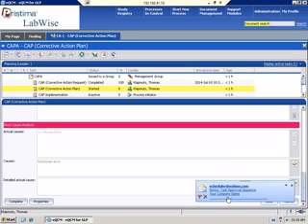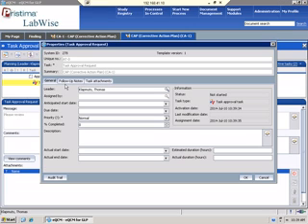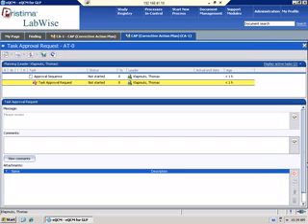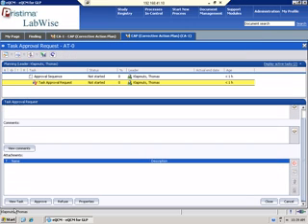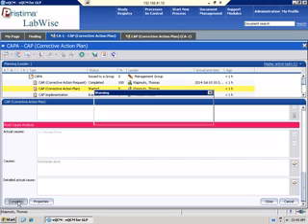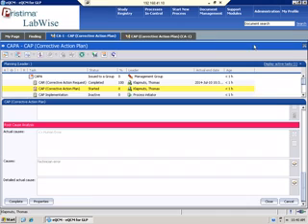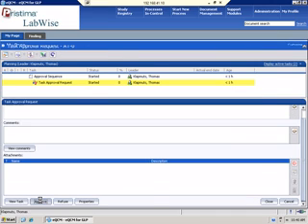And see, here's the scheduler that I was assigned a task approval sequence. Log back in. Here's my task approval. And so it says, please review any follow-up notes. I can view the task. So here, it's human error, technician error. Okay. And then I can approve it.